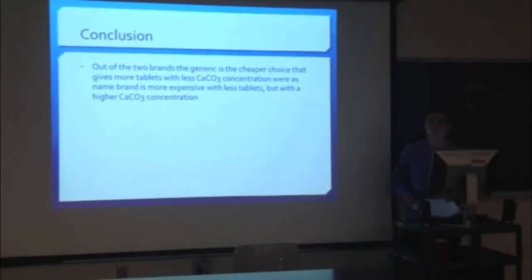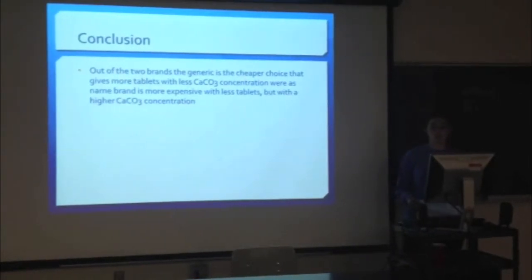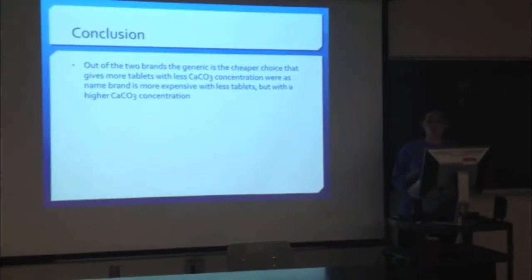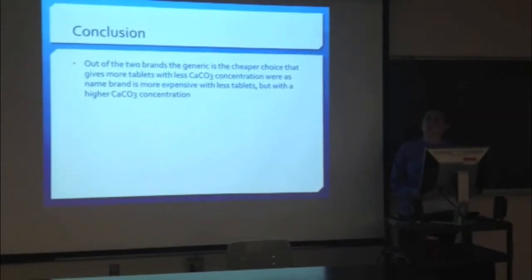The overall conclusion for the titration labs was that out of the two brands, the generic is the cheaper choice that gives more tablets with less calcium carbonate concentration, whereas the name brand is more expensive with fewer tablets, but a higher calcium carbonate concentration.